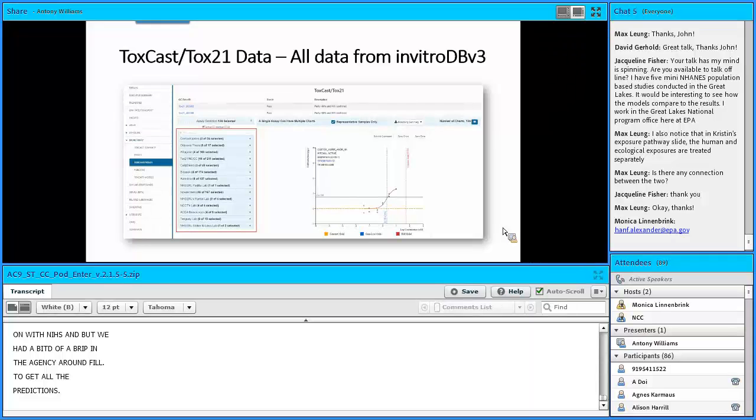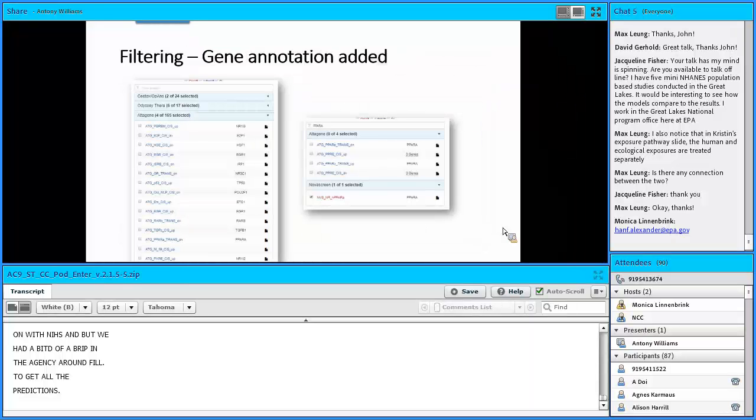You will see the details of each of the assays. You'll be able to drill down into the modal to see how everything was measured, whether there is associated literature, etc. By selecting active, we have 136 that have been selected. The number of charts on the right-hand side, you can see the top bioactivity curve here shown. And to the right-hand side, there is a blue button with a tile view that is going to show you a tile view of those particular bioactivity plots. So you have them all easily viewable without too much scrolling.